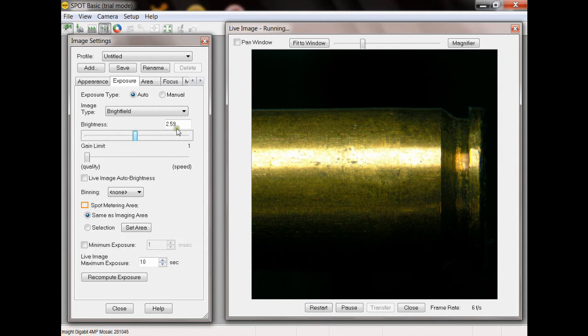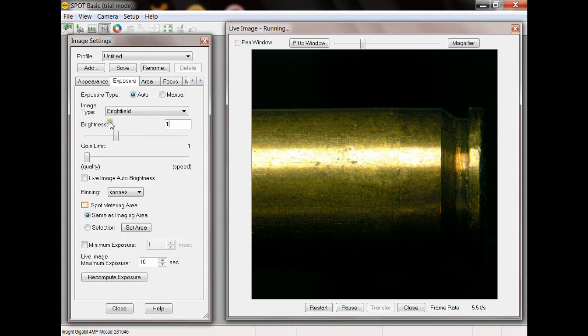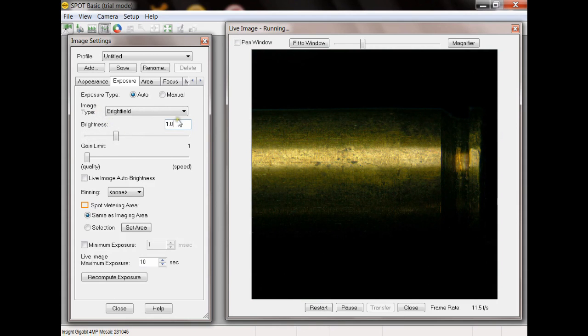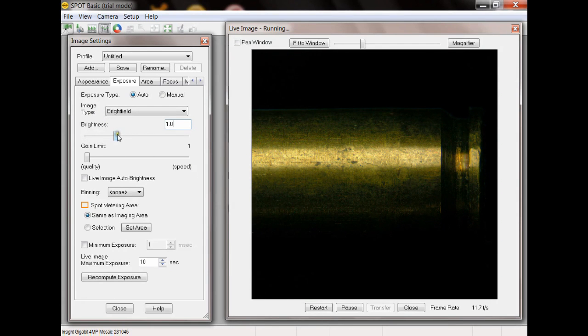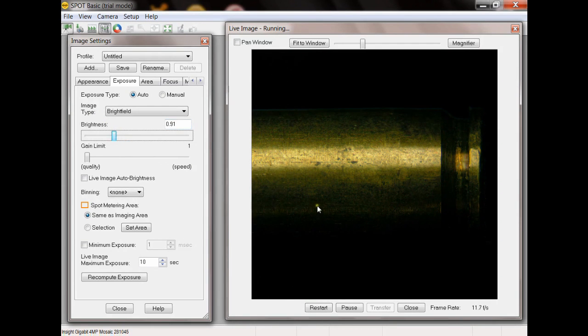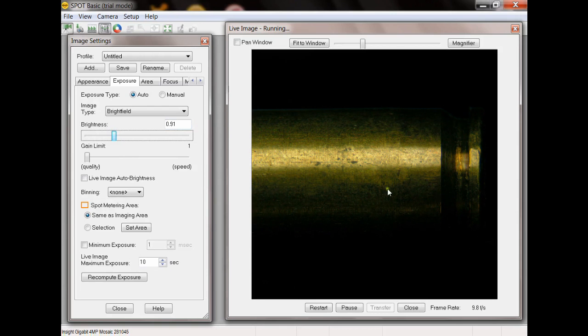So what I can do is actually underexpose the image and then do a gamma adjustment. Going back to one, this is the standard setting. I'm going to go down slightly. Let's go to point nine. So now the image being presented has no overexposed pixels.